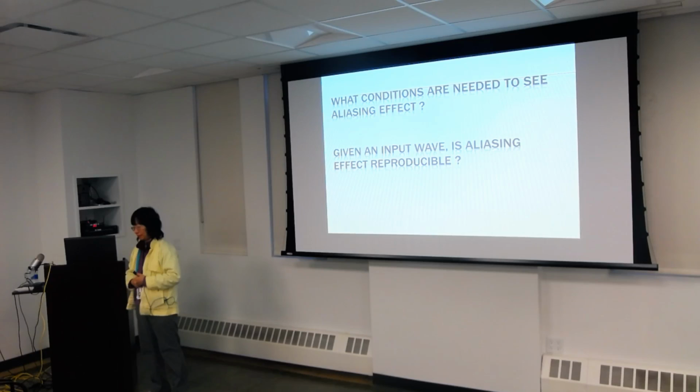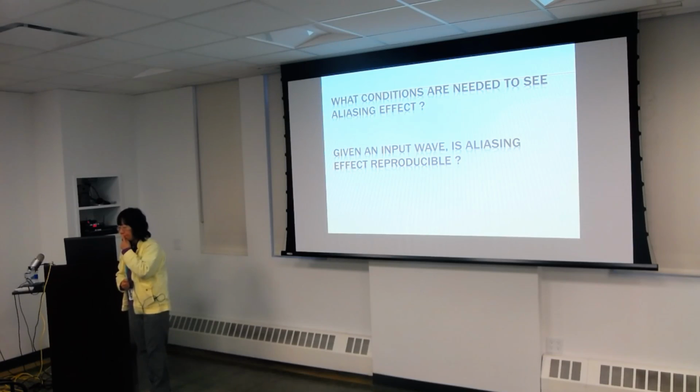Say it again? Isn't the Nyquist limit determined, fundamentally, by the number of pixels in the detector? And so isn't it a function of the detector, which would have noise? I think that's going back to what you said. Okay, so for a detector, your Nyquist limit is determined by your pixel size. It's not determined by the noise of that detector at all. It's a pure frequency question.